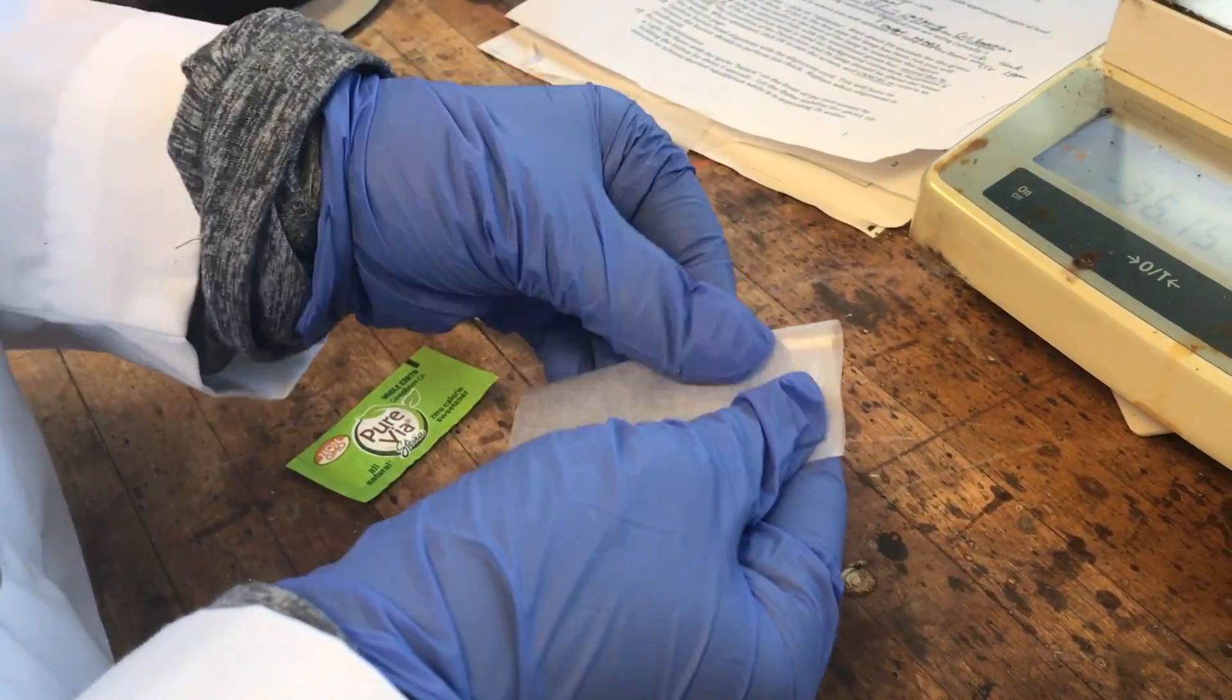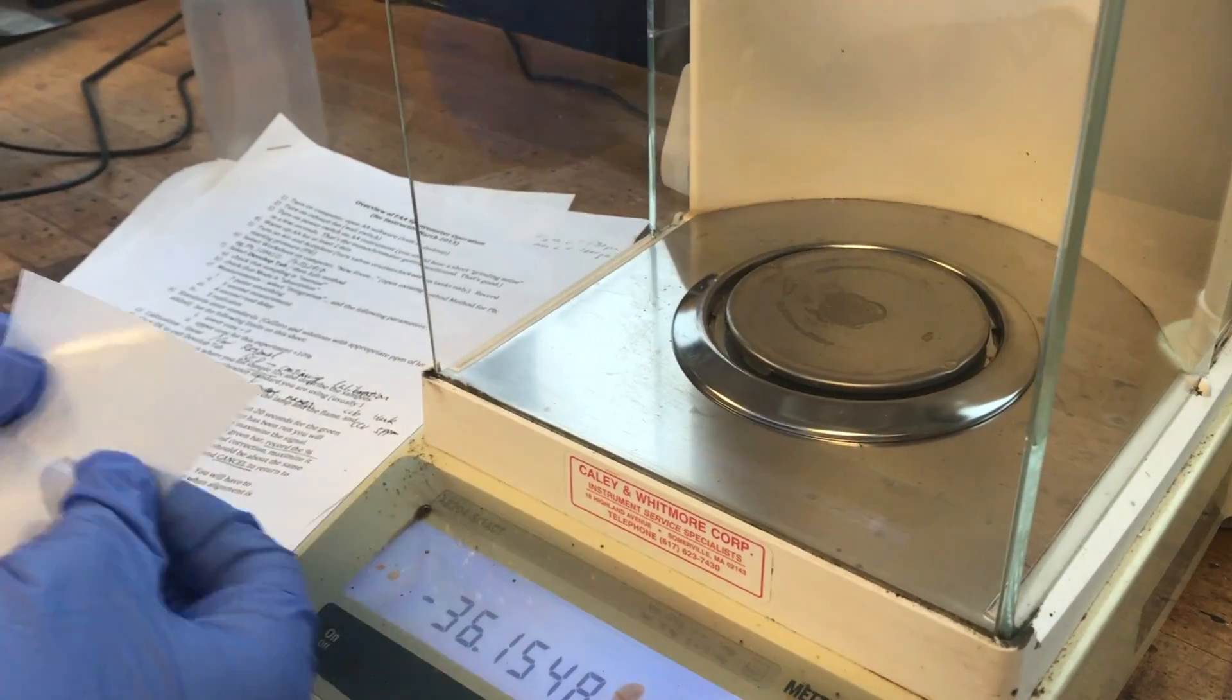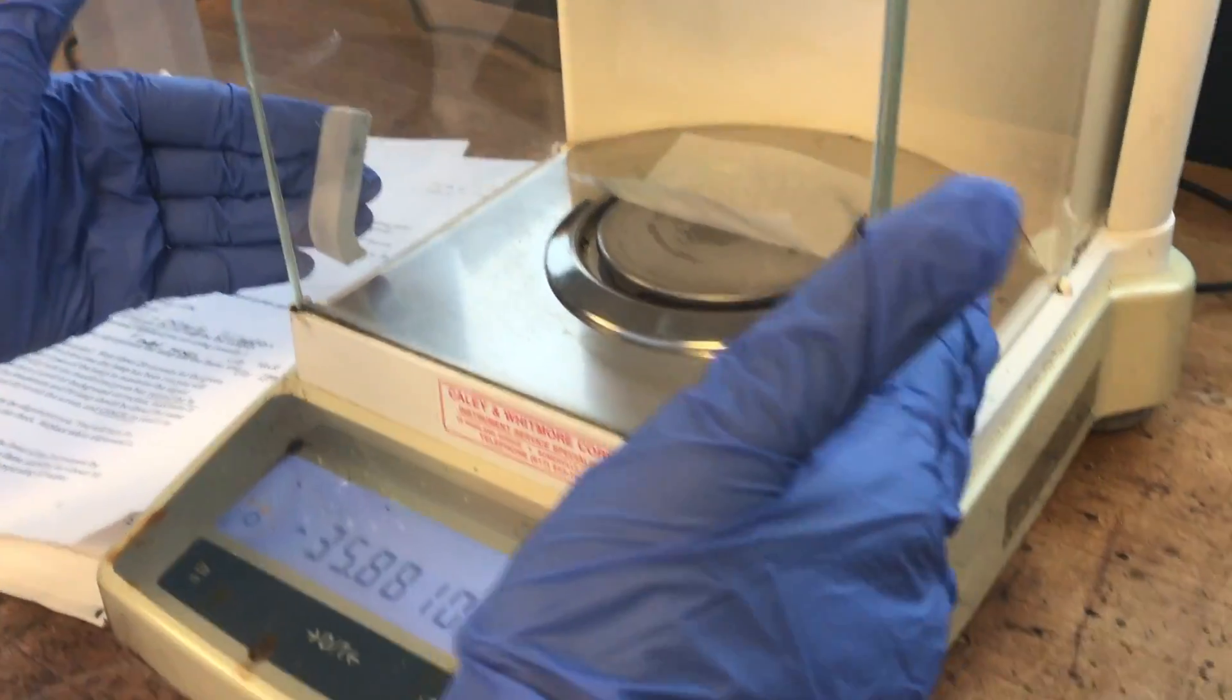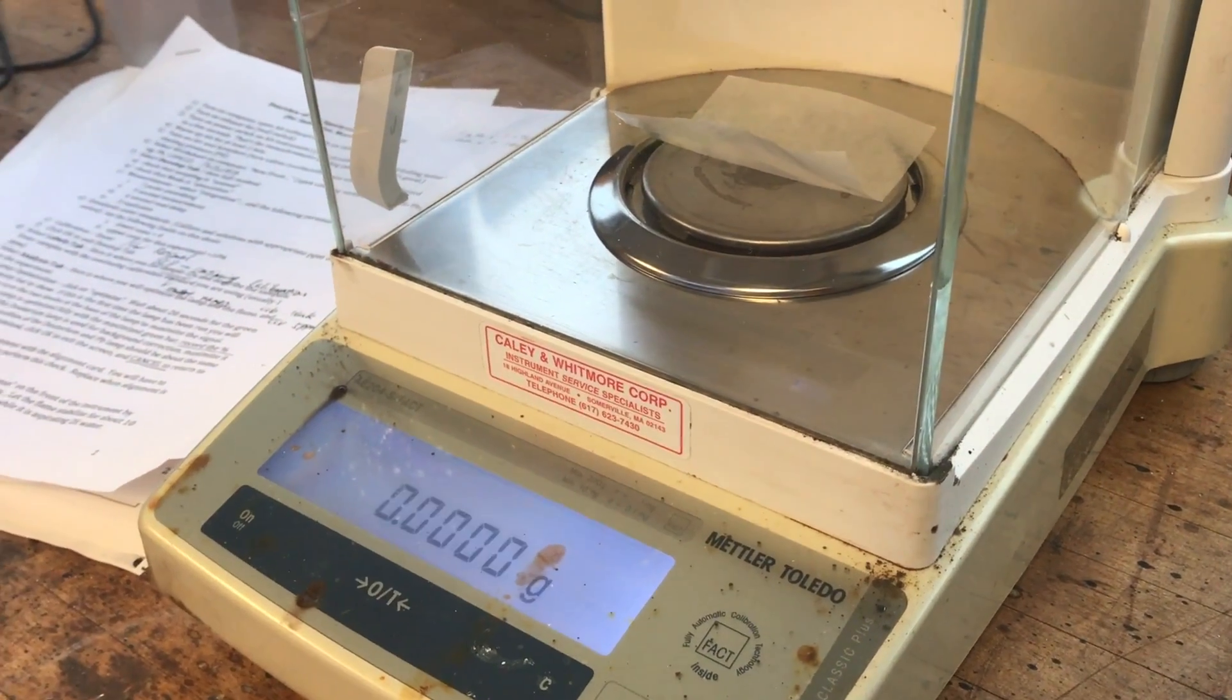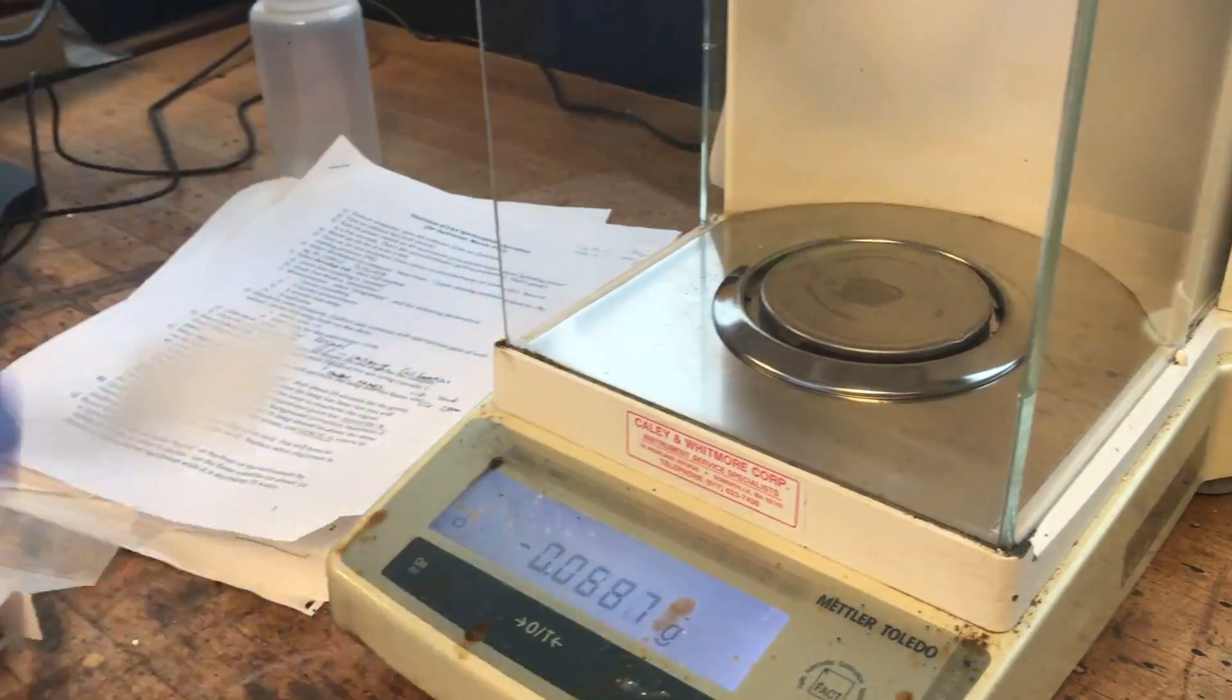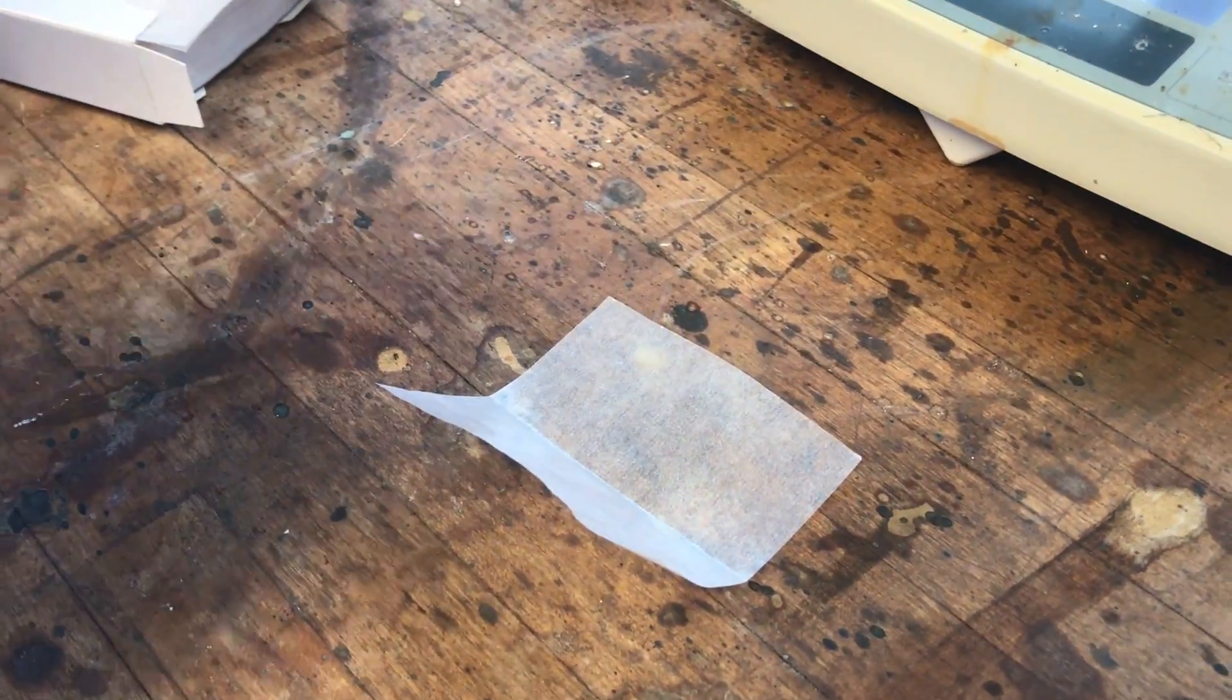For measuring solids, we use weigh paper. You can fold it in half and then place it inside the scale, tare it, and then place your solid onto the weigh paper.